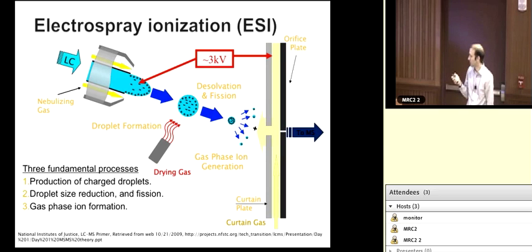So electrospray ionization, as I was saying, is a way we make an ion out of your metabolite. This is only one of many, many different ionization techniques, and we're not going to talk about all of them. Electrospray has really revolutionized the field. It's only been widely used for under 30 years. Since around 1990, it was coming into its own as a technique and became widely adopted.